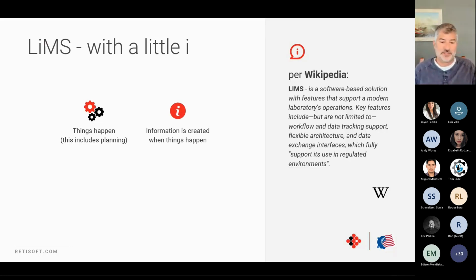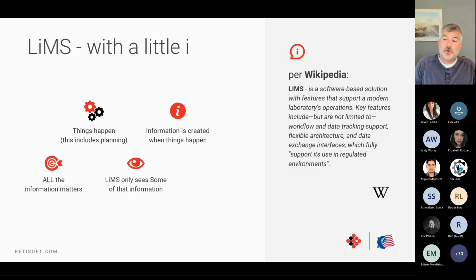Now there's tracking of what has happened. All of that information matters, is the catch. And this is why a little "i", because LIMS can only see a small fraction of that information that is actually valid and important in any kind of a lab setting. So what's missing?